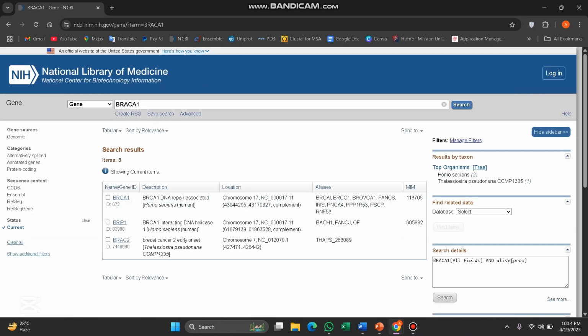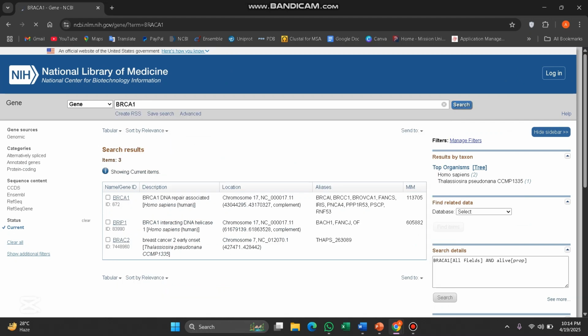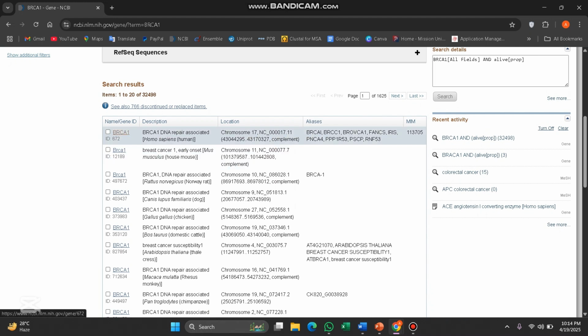Okay, we got BRCA1. Just click on Homo sapiens, the first one.